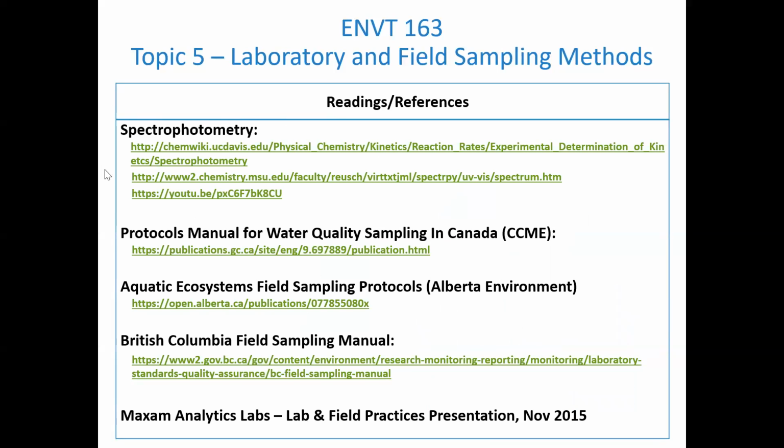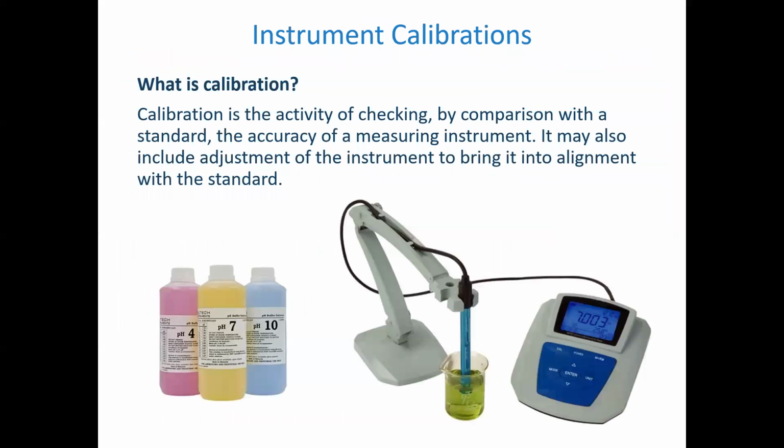We're going to be talking about spectrophotometry, which is what we're going to talk about in Thursday's lab. And there's a whole bunch of field sampling manuals and things out there. What I want to do is mostly just cover the basics. Every company and lab you're going to work for might have their own little protocols and systems around it, but there's a lot of things that are relatively basic and standard, and we'll get to those in a few minutes.